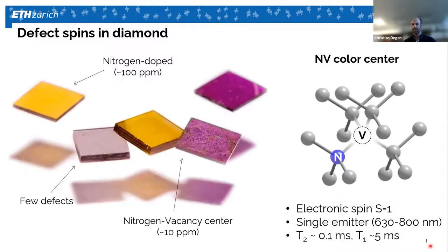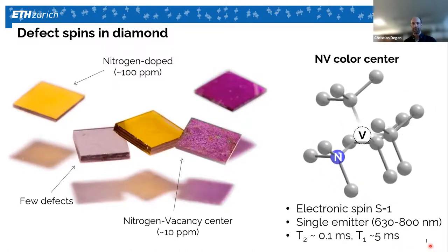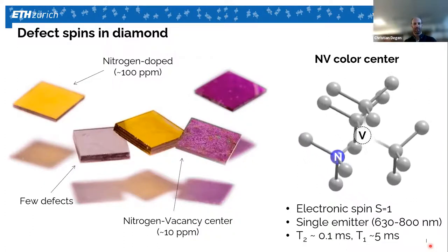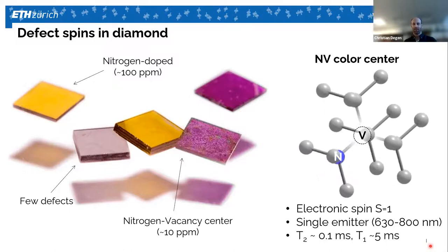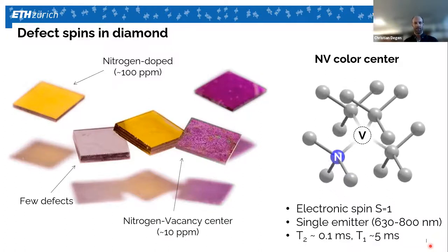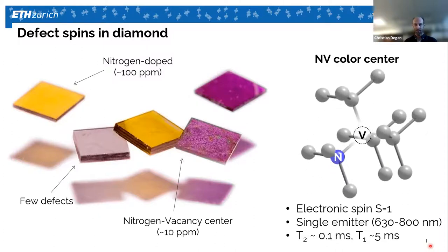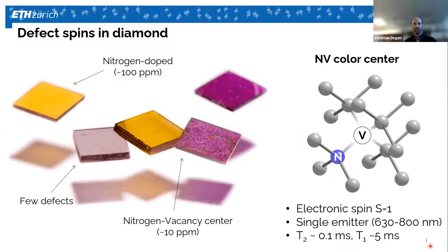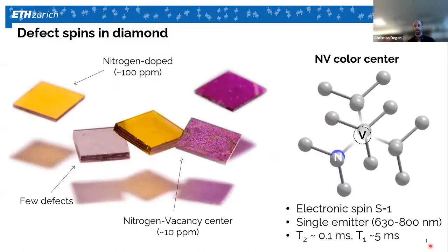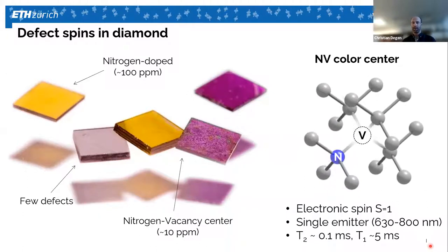Good, so what is this NV center, or more generally defect centers in semiconductors and insulators? So if you have a crystal lattice, it often has defects. And many of those defects are optically active, so they cause the color in diamond shown to the left. So these are all diamond crystals. Some of them are very pure, the gray one, and then the yellow one has a lot of nitrogen. So these are atomic defects. Diamond has hundreds of defects. This is why it has so many colors. Then some of those defects are also magnetic, meaning you can detect them by EPR.